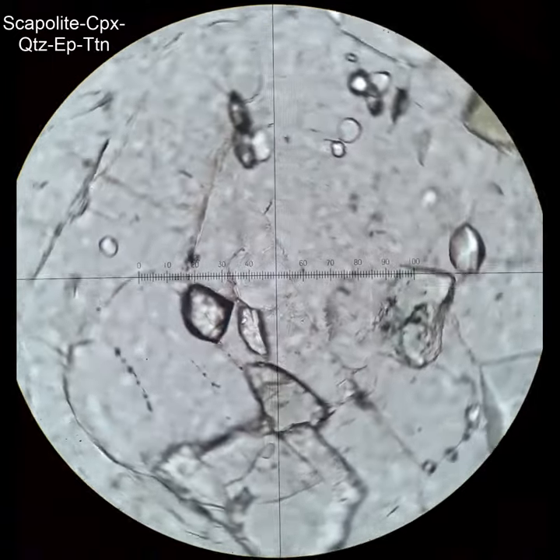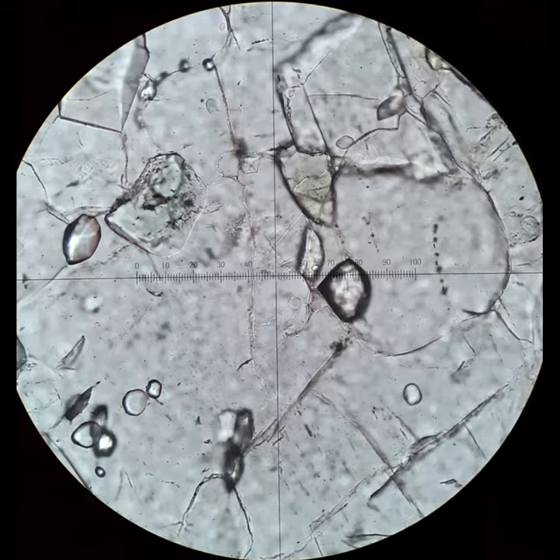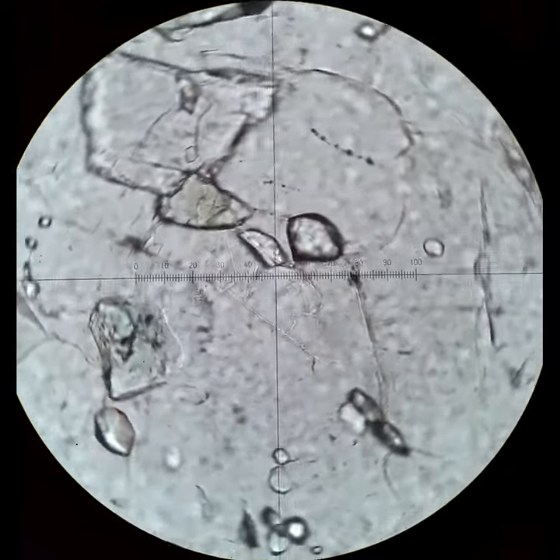So this is just a closeup of one of those grains. Low relief, probably can't even make it out. I can barely make out the grain margins there.